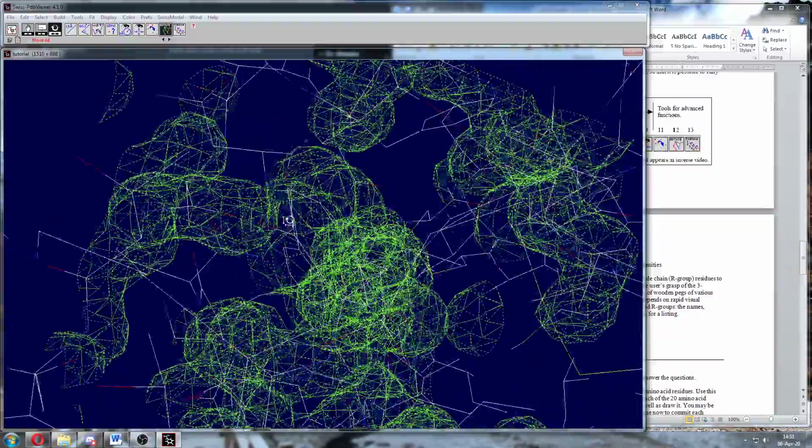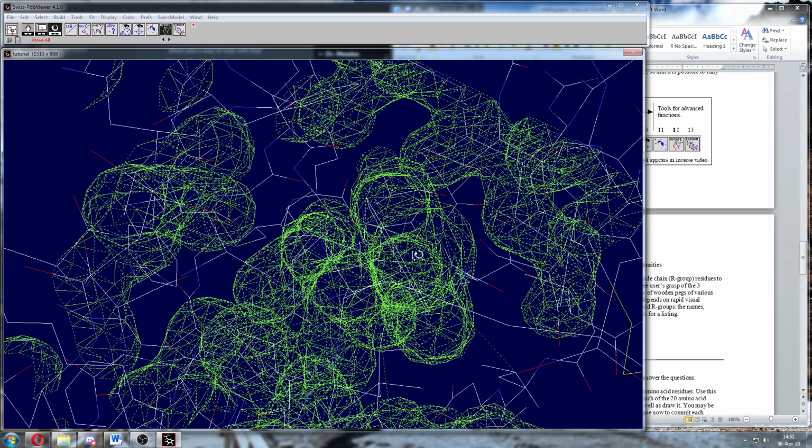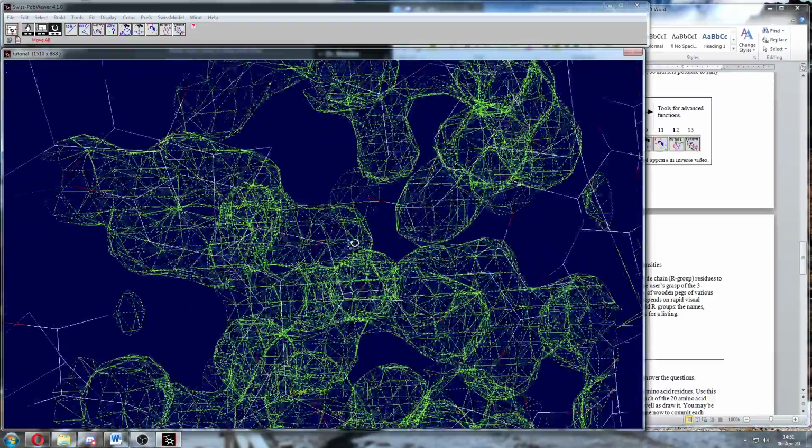Well, it looks like it fits, except you notice the angle's off a little bit. Right? It's not quite the right angle. So I'm going to put it here. Hopefully I can click on it and change the angle of that ring and move it just a little so I can get it to fit. Now does it look like tyrosine fits better? Yeah, I got it almost exactly.